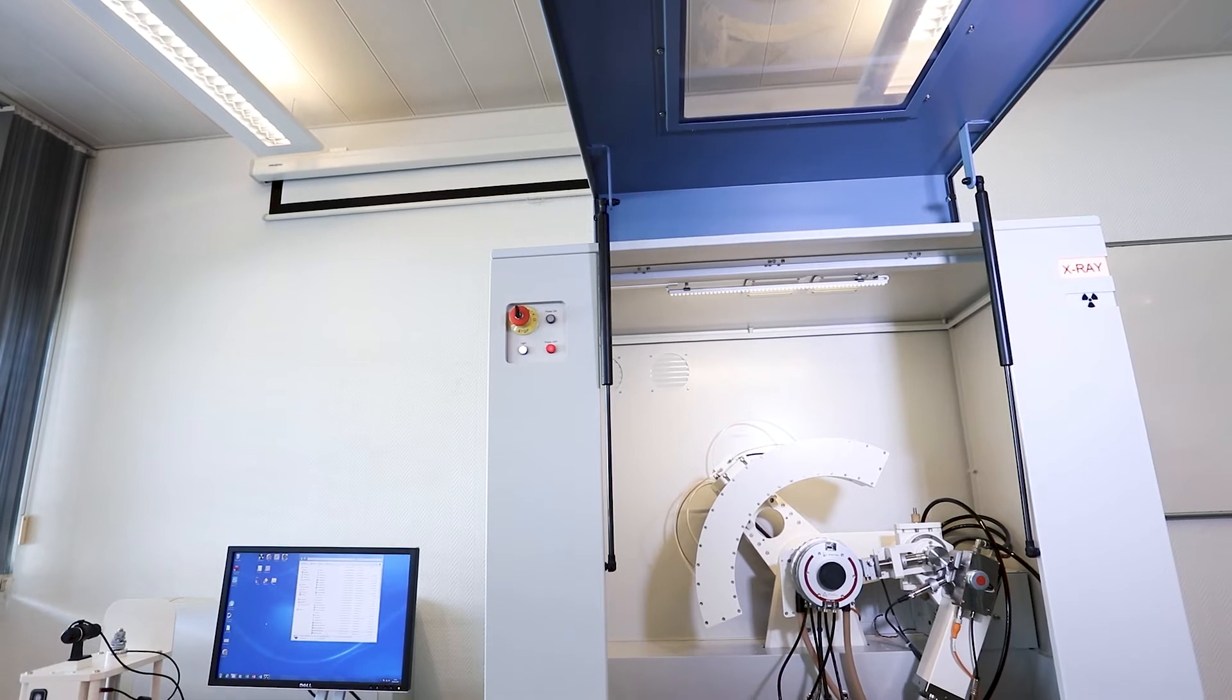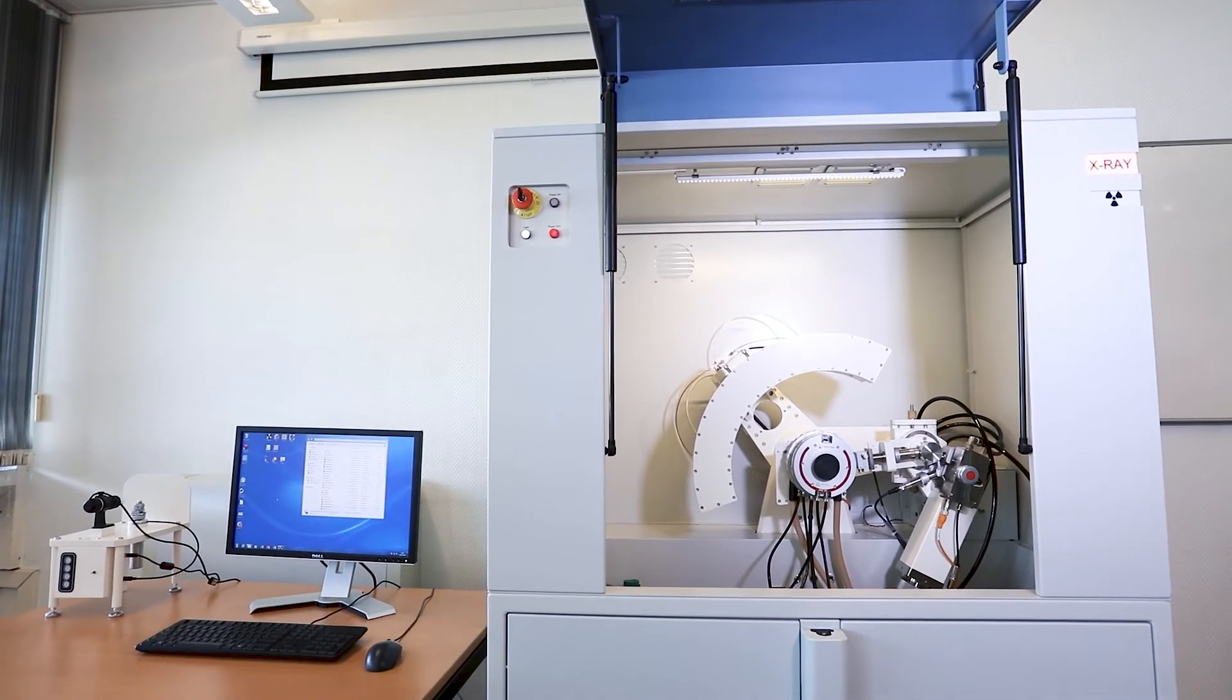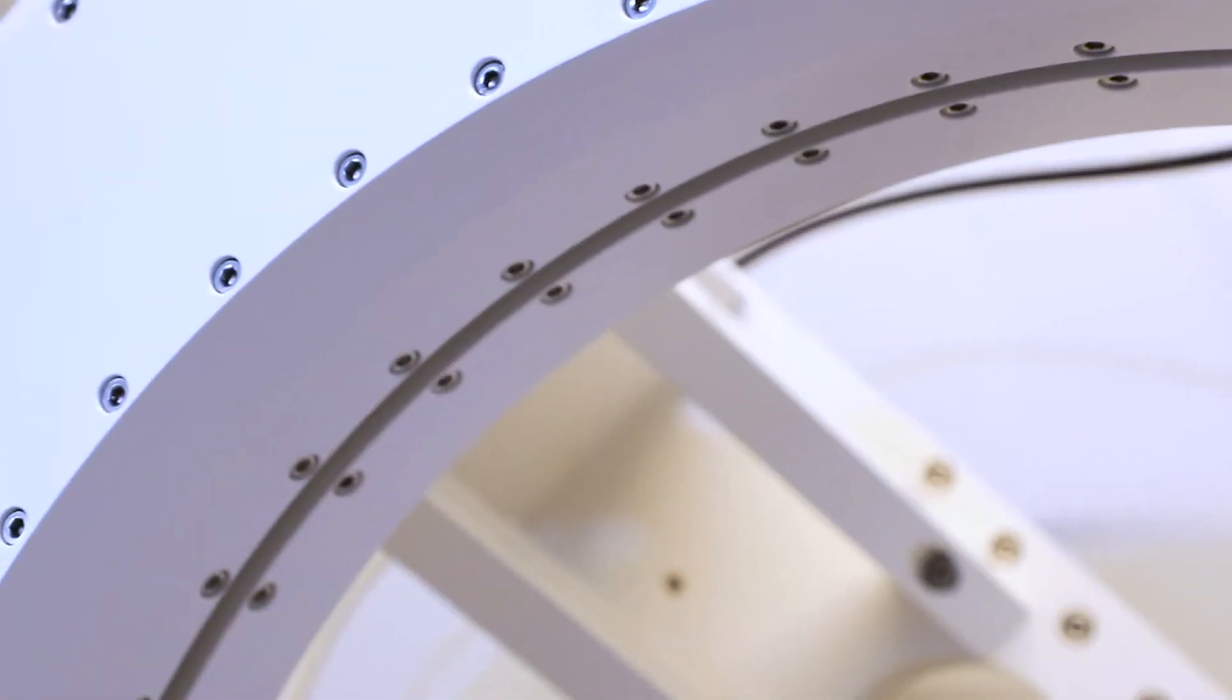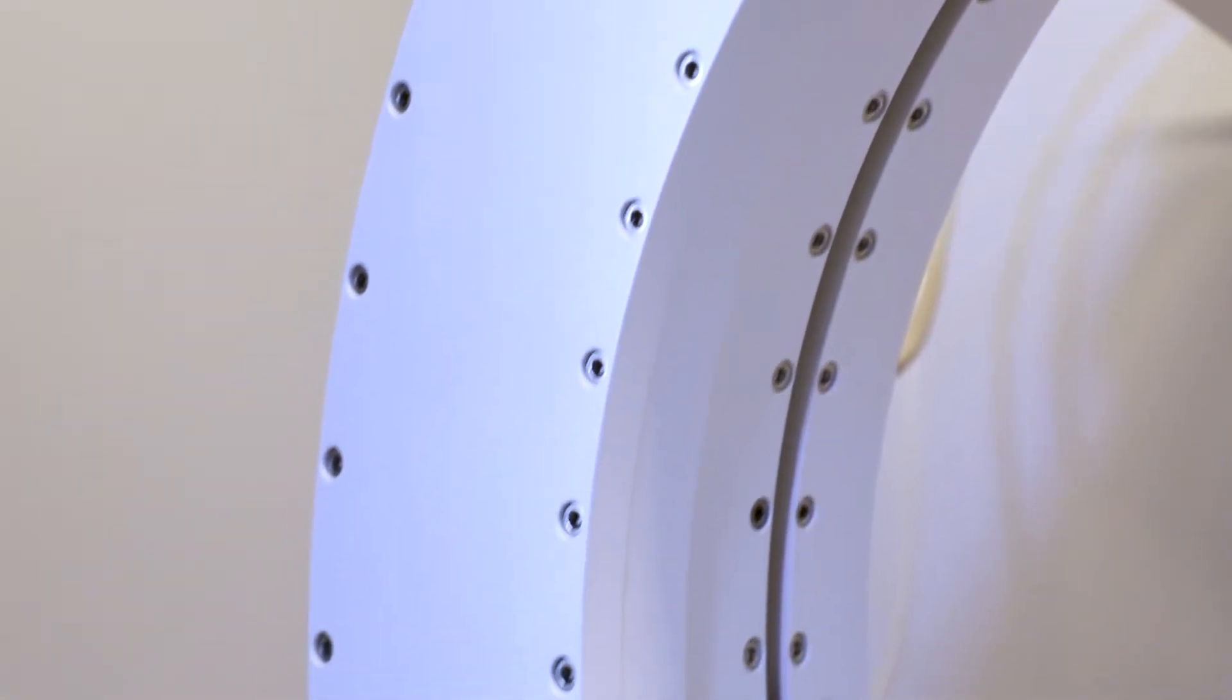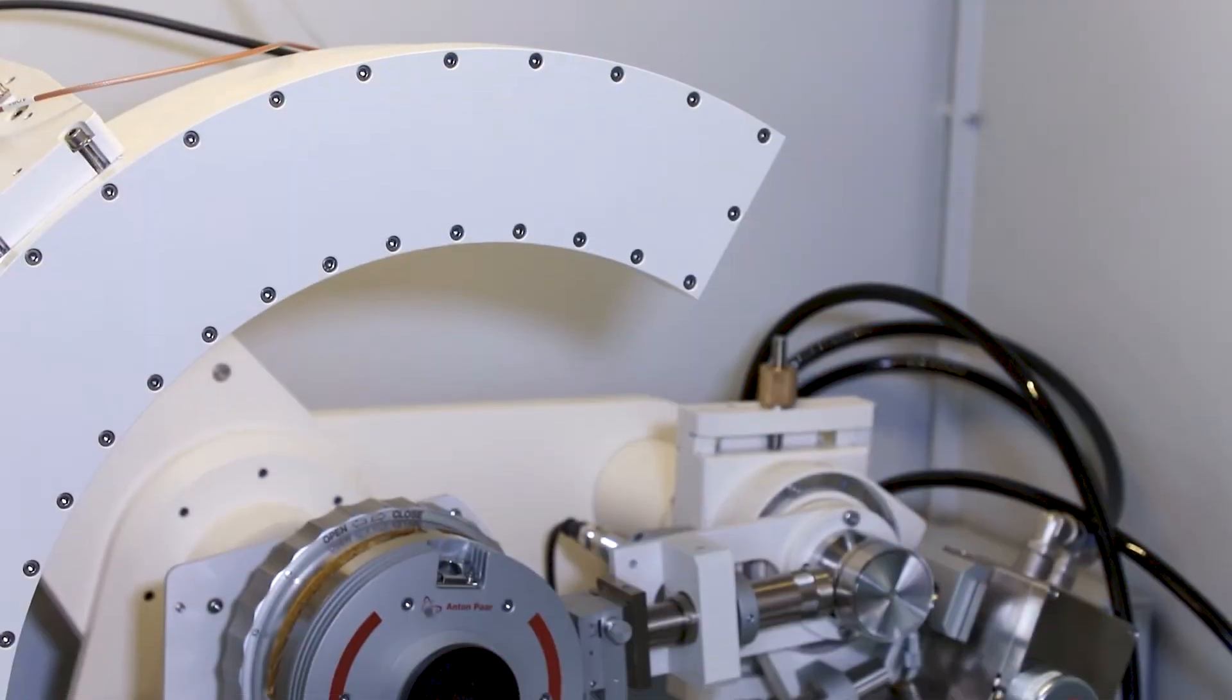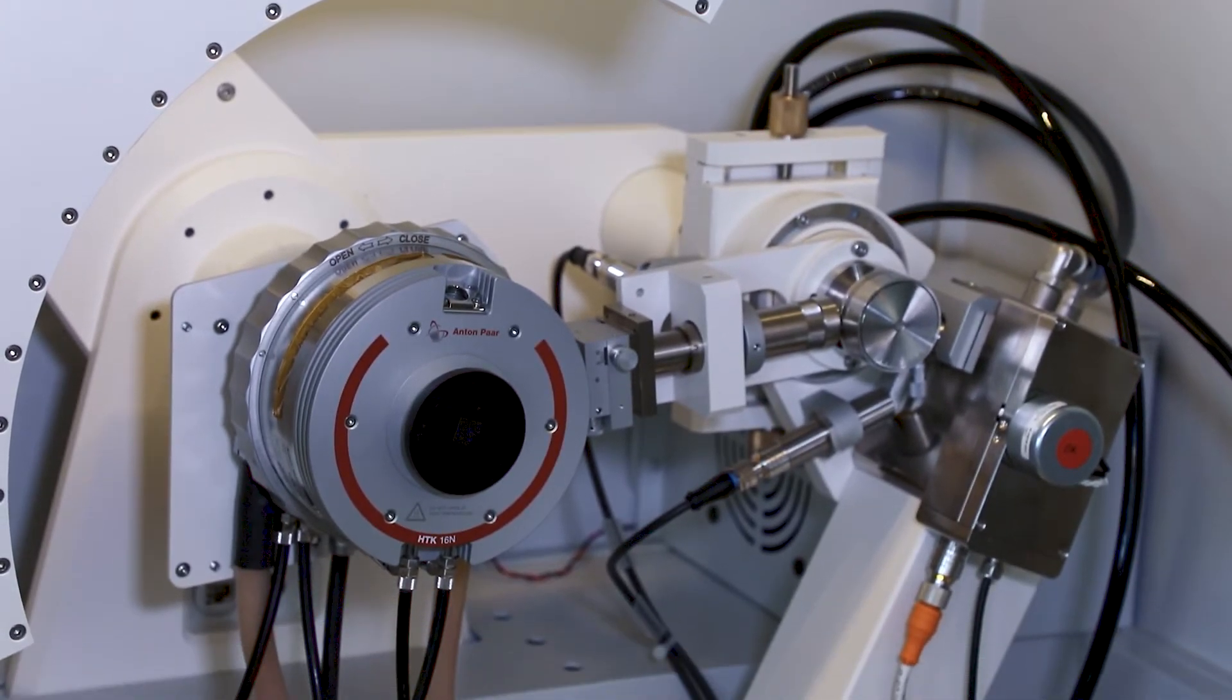The ARL Equinox 3000 and 3500 instruments feature a unique curved position-sensitive detector for simultaneous acquisition of full diffraction pattern, enabling faster analysis, in-situ experiments, and studies of crystalline phase development and phase transitions.